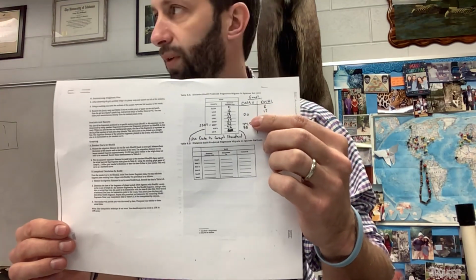And then on the graph, the DNA that you're going to be determining something from, you also need to move it over a decimal place. So it should be like 2.0, 3.45, 3.6, 0.6, 1.7. Does that make sense? So make sure you move the decimal over on all those.